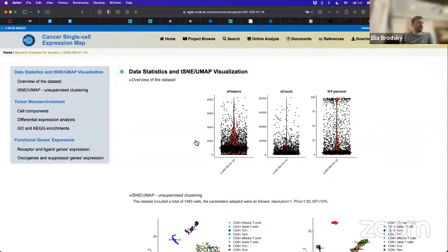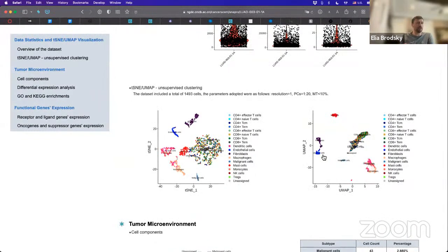So again, you will find here we have some dimensionality reduction with t-SNE and UMAP. You can see that UMAP is typically going to be a little bit better, making the separation greater between the larger groups. But actually, if you compare the two, it's obvious that both are useful. For example, here I have a greater resolution of this mixed cluster. And here this mixed cluster is very condensed together, right? So if you scroll down, let's just take a look at this chart right here.